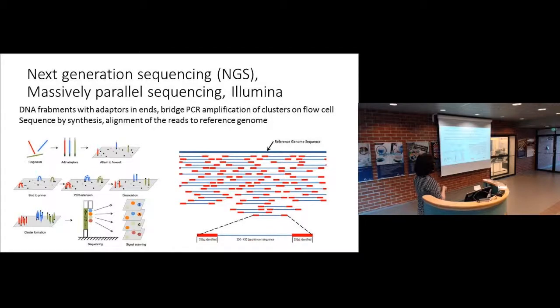And then when you sequence, for every base there are different fluorochrome labels, and it measures cycle by cycle the synthesis in the sequencing reaction. And then from these images of the flow cells, after every nucleotide, it measures the signal, and that's how it reads the sequence of every single cluster, millions of those clusters in the cell. That's the basis of Illumina sequencing.